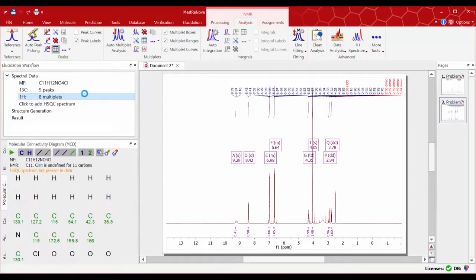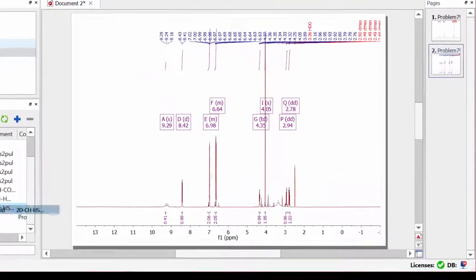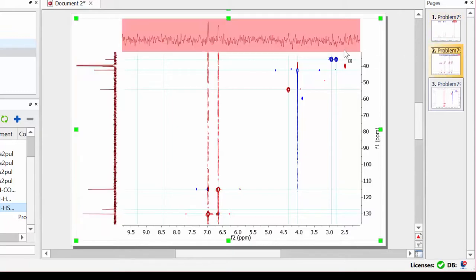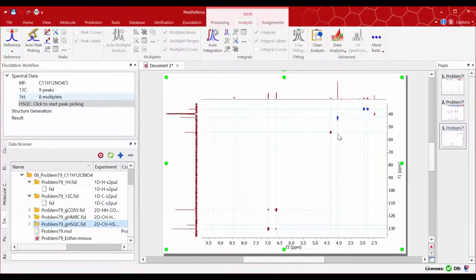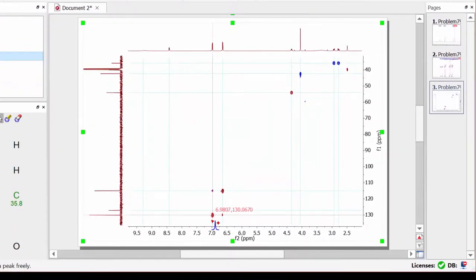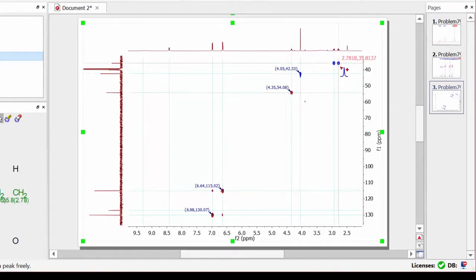Now it's time to add your HSQC experiment. Drag your 1D traces, then click on 'Start Peak Picking' and carry out manual peak picking on the desired cross peaks to be included in the elucidation.